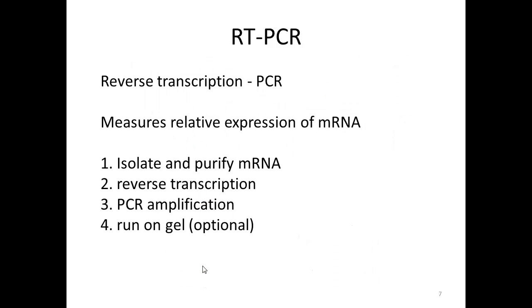Another very useful method for RNA analysis is reverse transcriptase PCR. Now RT-PCR will not always mean reverse transcription PCR. It can also mean real-time PCR, and you'll have to tell by the context which one of these methods is being used. In this class, we will not speak about real-time PCR. We'll always talk about reverse transcription PCR.